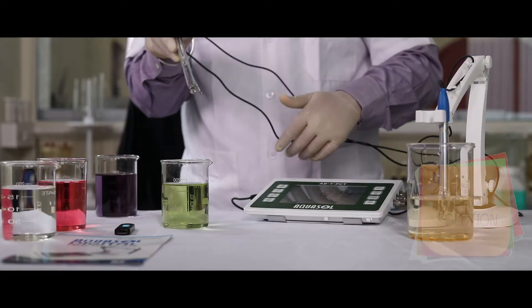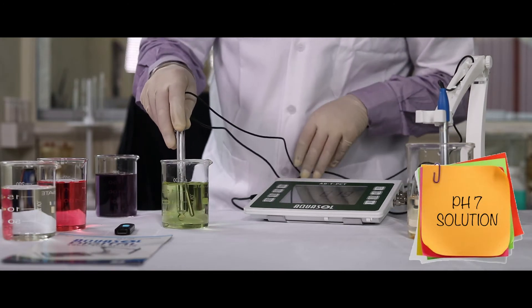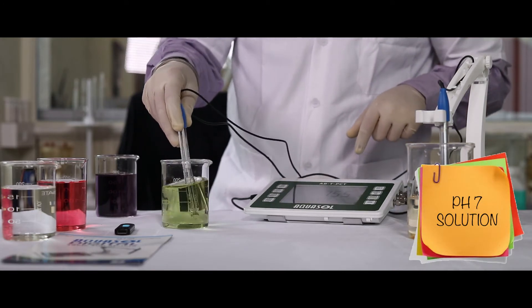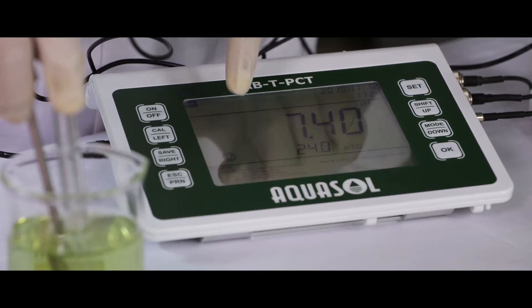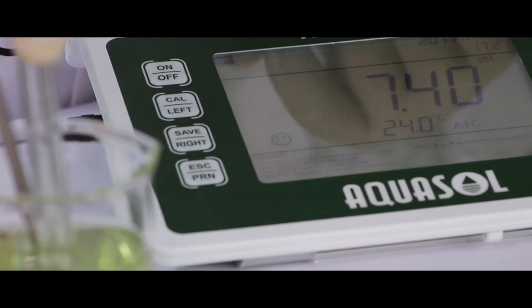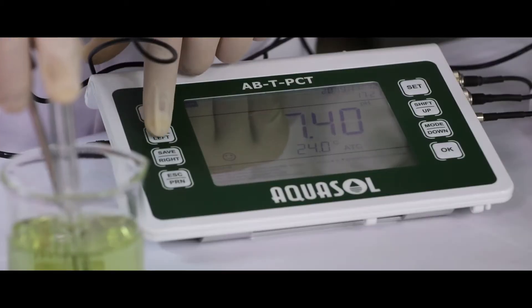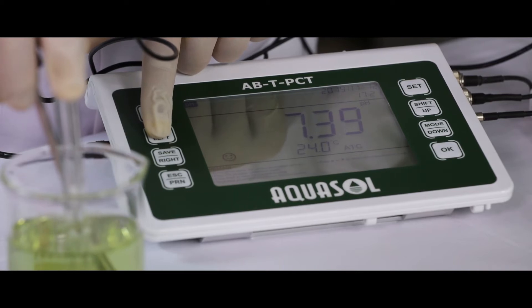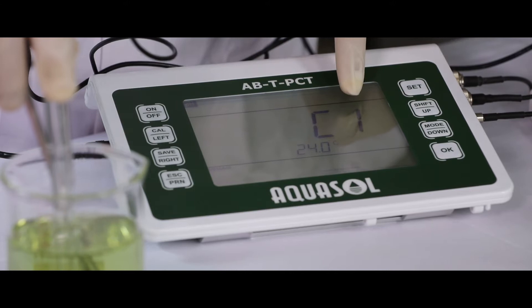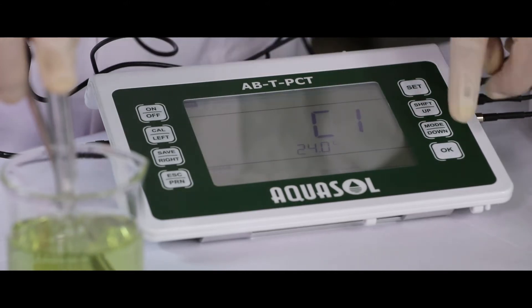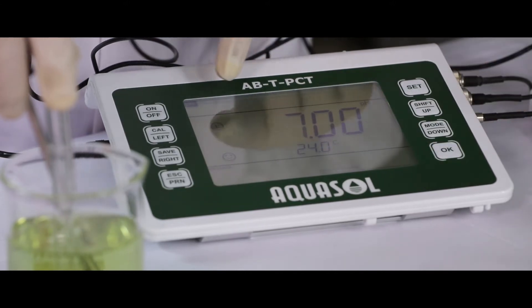For calibration of pH, dip the pH electrode in the standard pH 7 solution. Once the readings stabilize, a smiley emoji will appear on the display. Now press CAL key to calibrate. C1 indicates pH 7 solution. Press OK to continue.